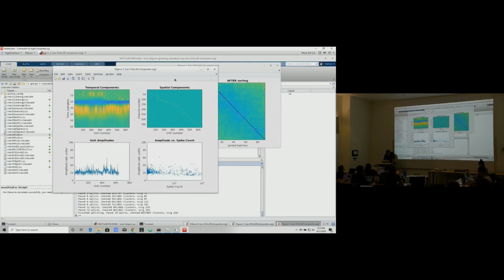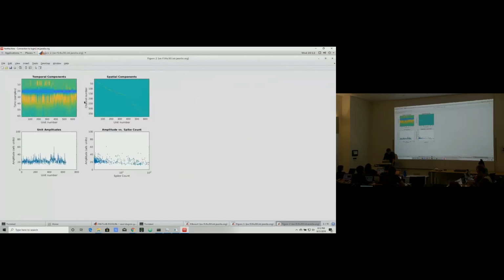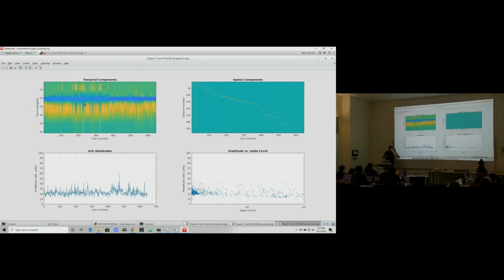And there's also the temporal components. You could think of them as maybe the component on the biggest channel. It's not quite that. It's not quite the time course on the biggest channel because they're obtained by this SVD procedure. So they're the first SVD component of the entire waveform. Whatever is the biggest time course in your waveform, that's what's plotted there. And they're all nicely aligned to sample 21, which you can see here.